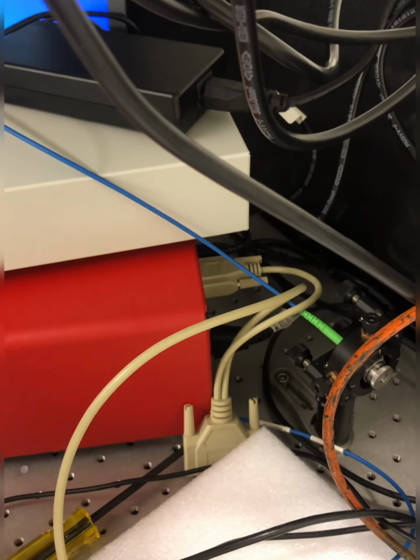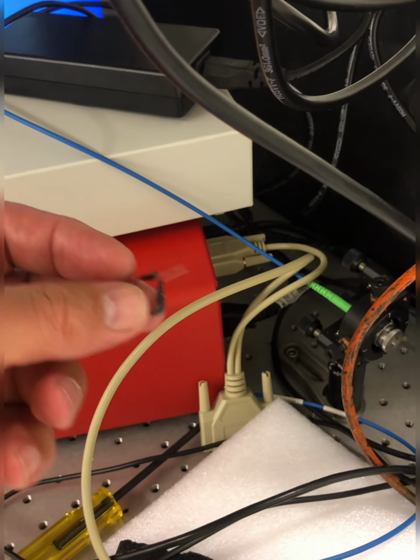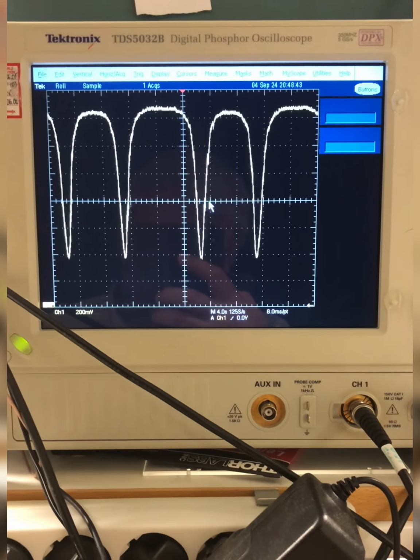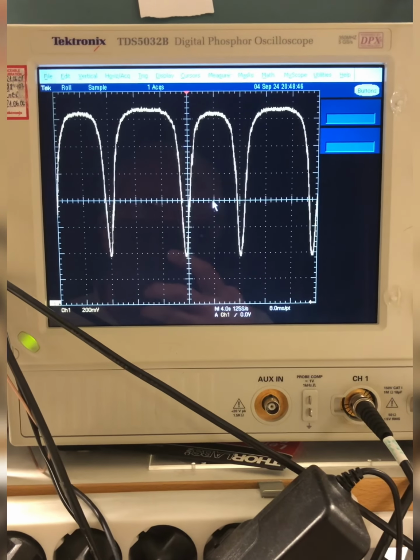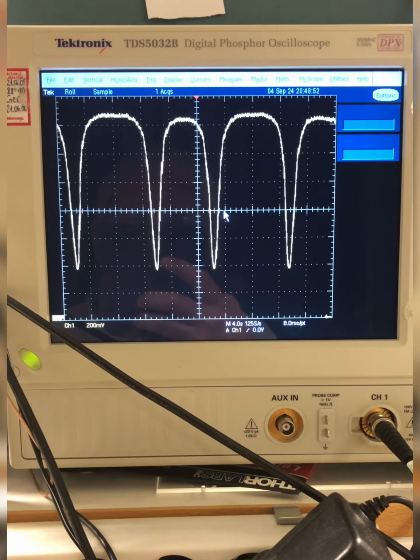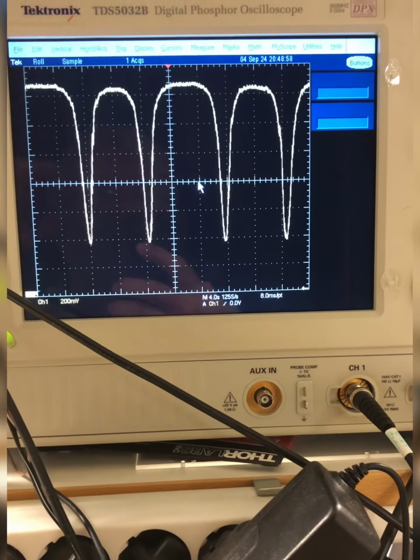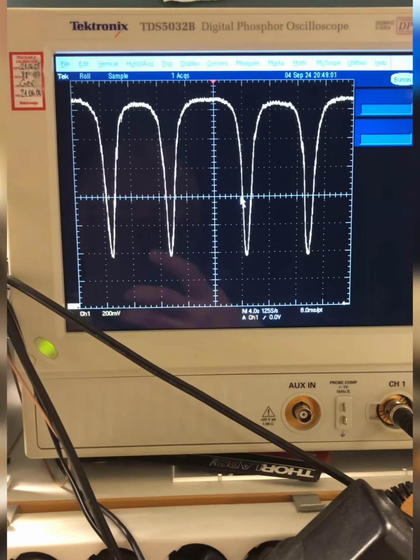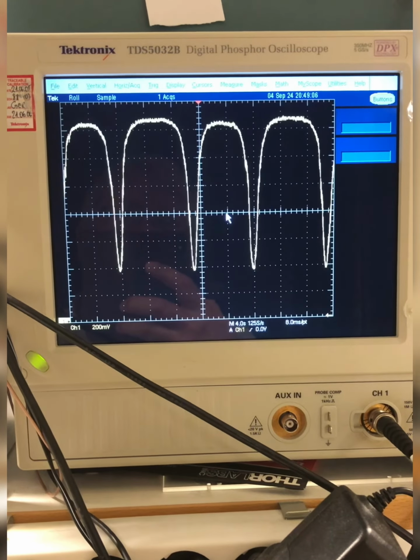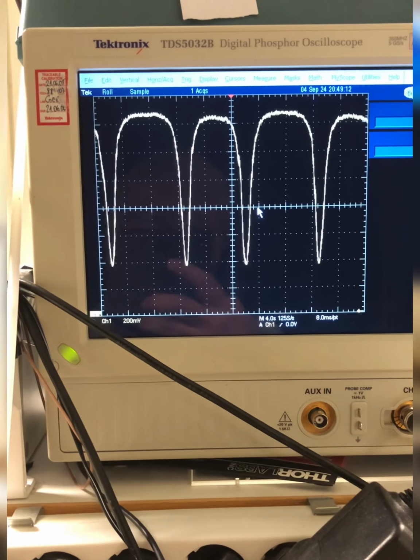RS232 signal cable, and the cable was checked with a jumper between pins 2 and 3, so that the wires are crossed. We are jumping 4 GHz, from minus 2 GHz to plus 2 GHz around the center position of the acetylene line at 1534 nanometers. And the jump happens every 10 seconds, and dither is on.